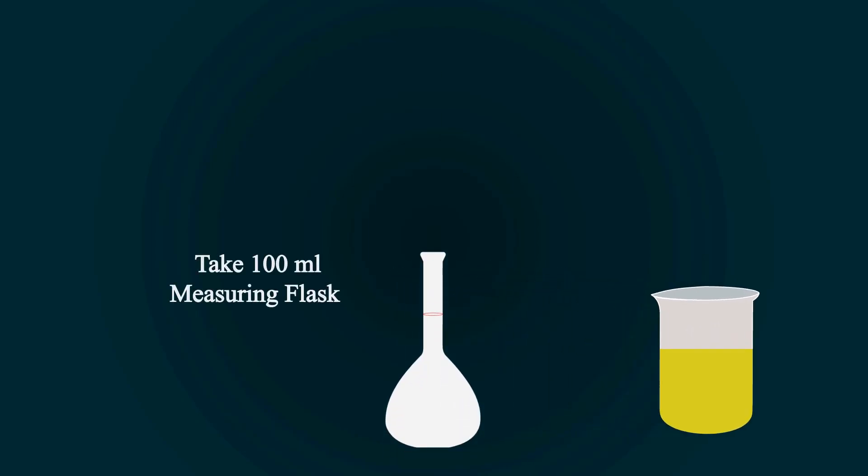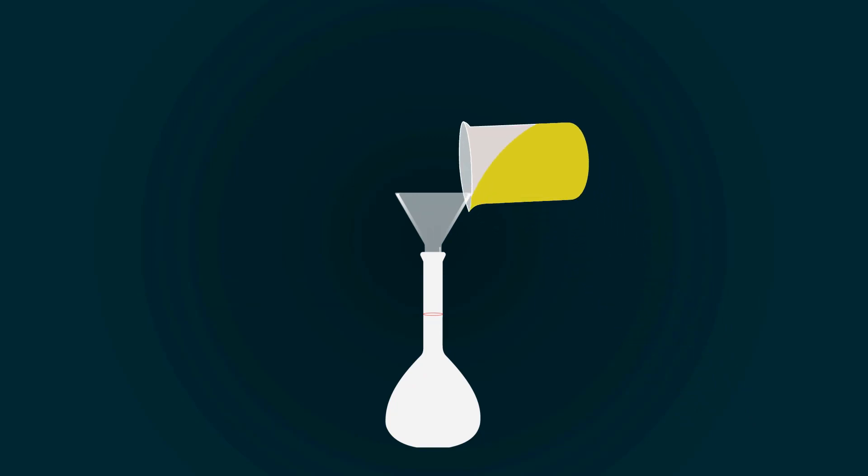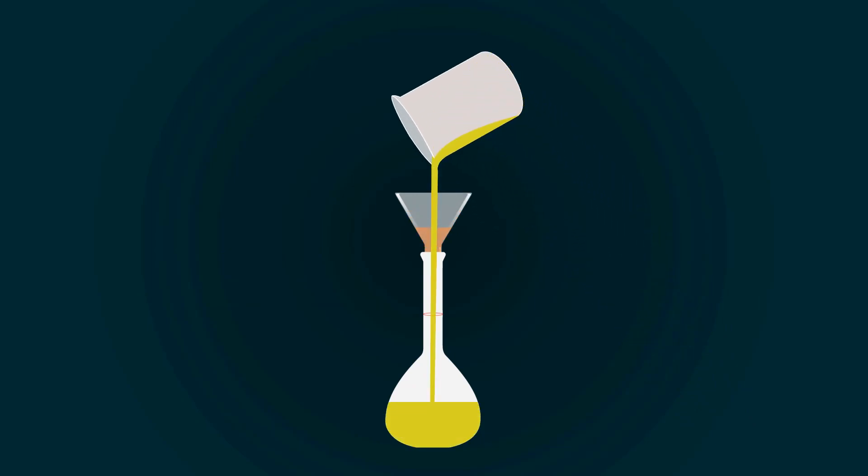Now take a volumetric flask of 100 milliliters and put a funnel on the top of the flask. Pour all the solution into the volumetric flask. You have to fill it up to the 100 milliliter point.